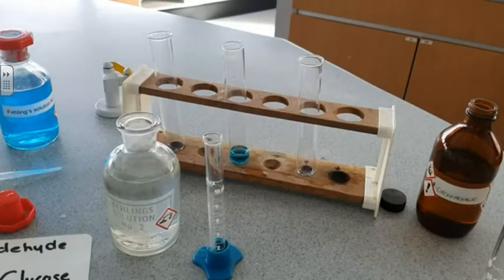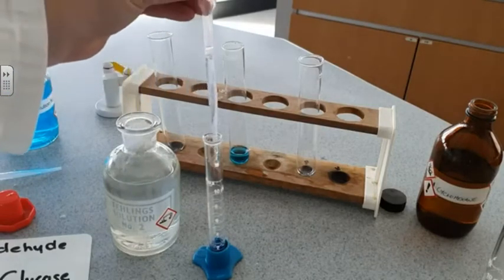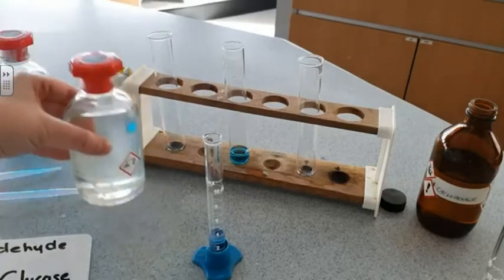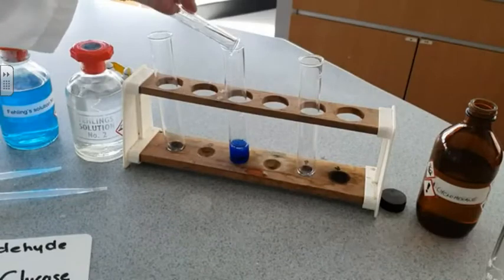So we're just mixing Fehling's 1 with Fehling's 2 here. Fehling's 2 contains some sodium hydroxide. So mix these two together to make Fehling's solution. So there's our blue solution of Fehling's.